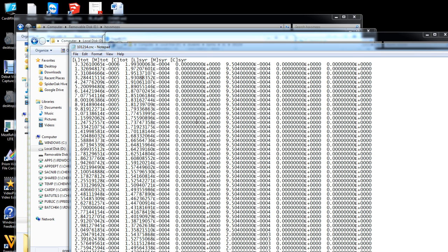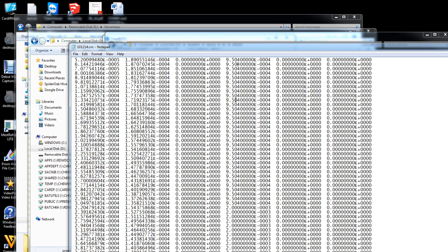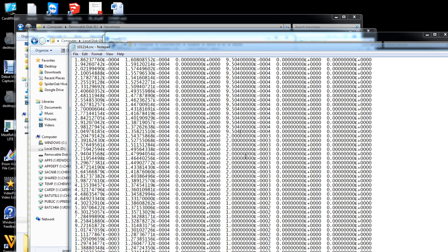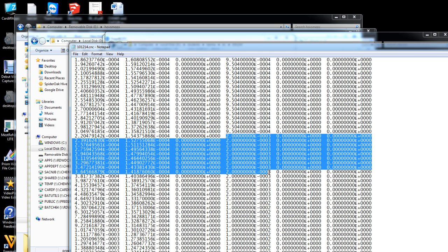This is the concentration of the competitor in the cell. There is never a competitor in the cell. And this is, something went wrong. This is the concentration of the ligand in the syringe. And for some reason, the concentration of the ligand in the syringe has been going up. But I think I know what happened. We have 1, 2, 3, 4, 5, 6, 7, 8. So what has happened is that because I left the other titrations in, it did further calculations, and it assumed that these are the additional injections.